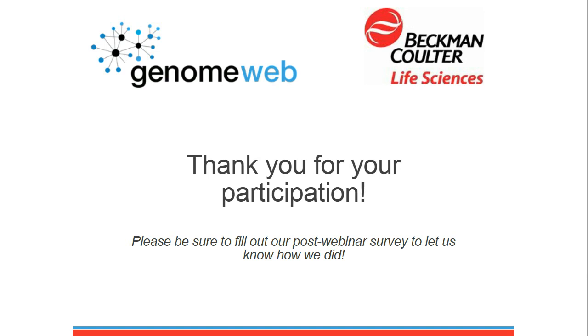So happy to get in touch and send you that literature to show the concerns about how acoustic ejects the drop and could probably cause aerosolization is not really a valid concern because the data shows otherwise. But great question. Thank you for the question.